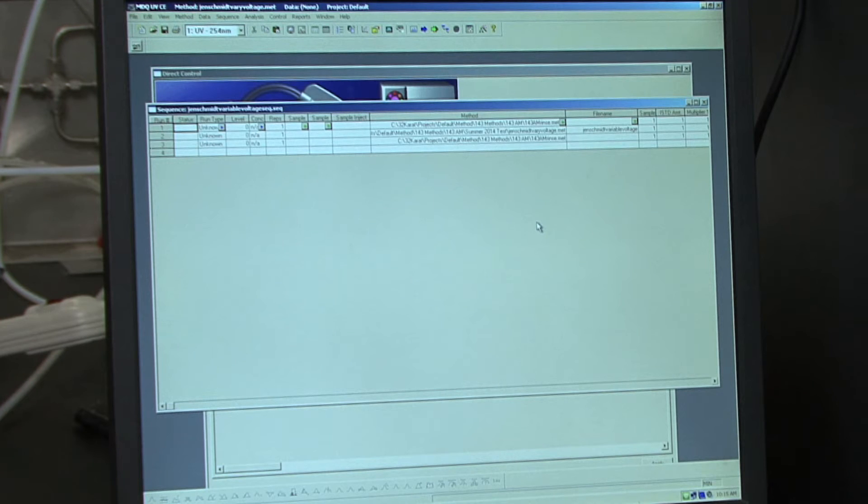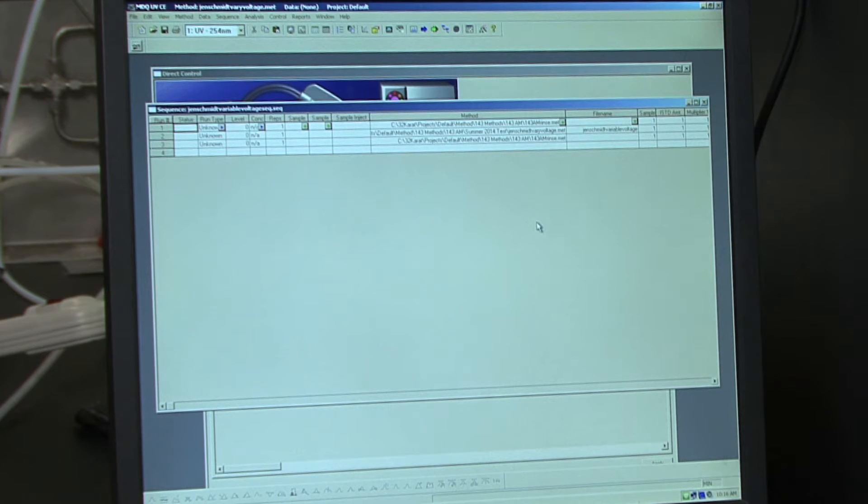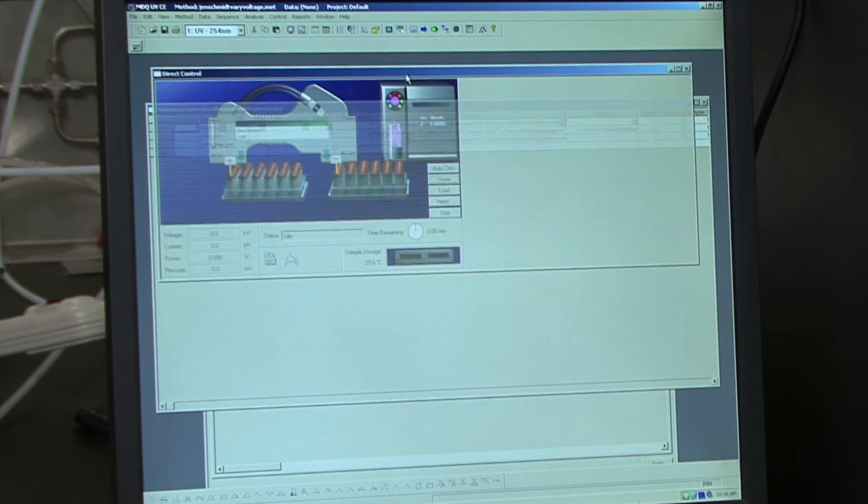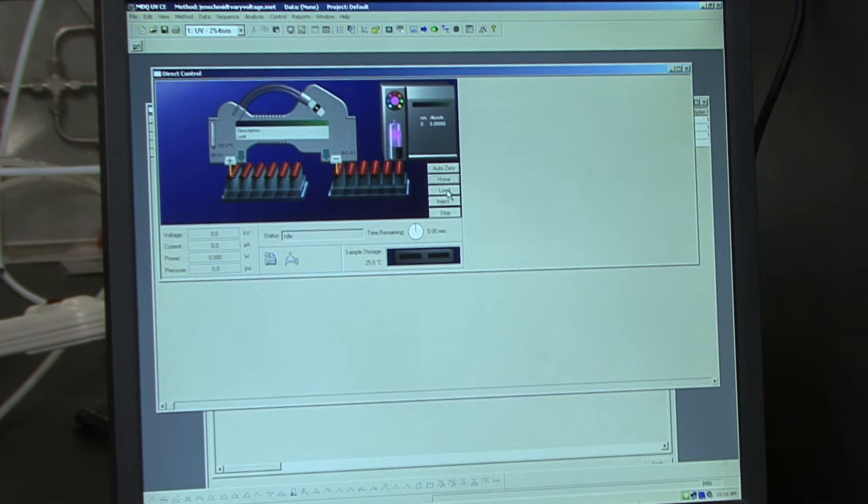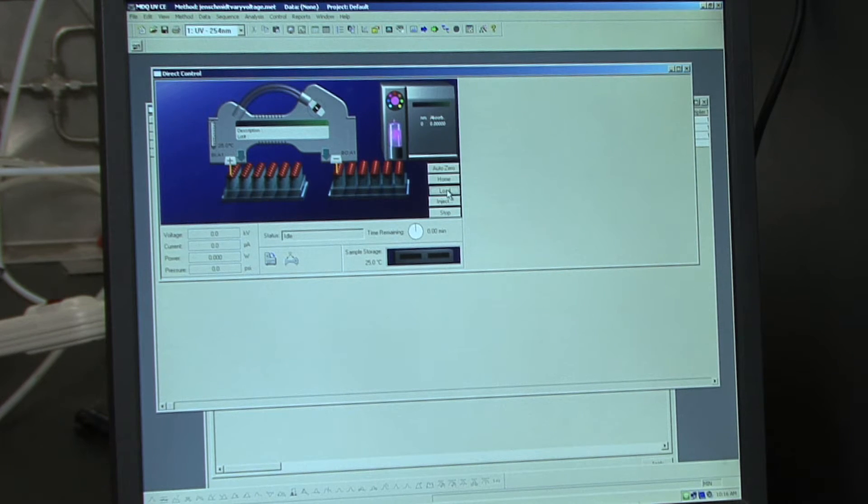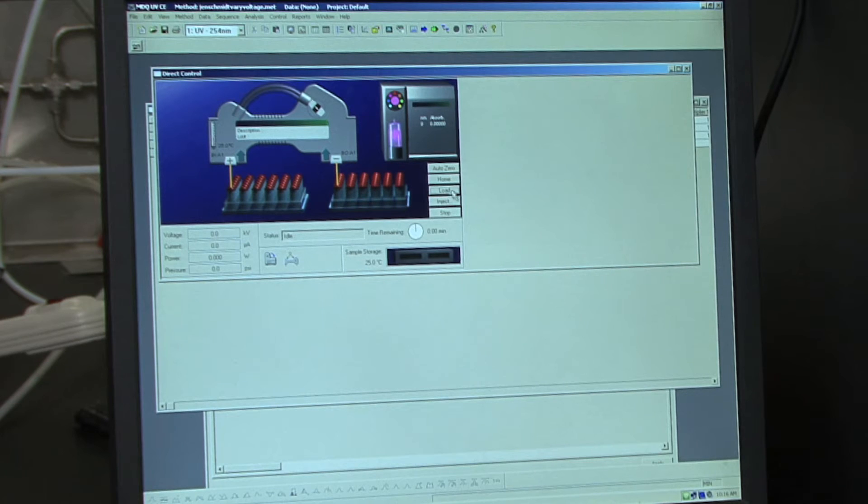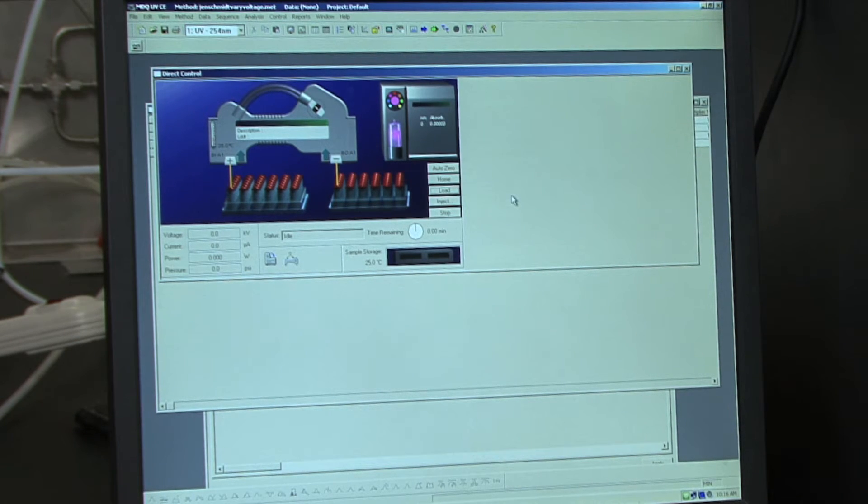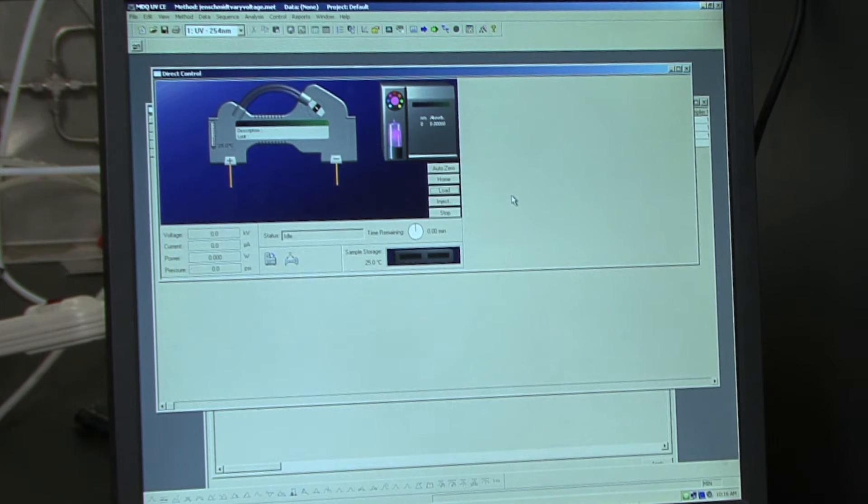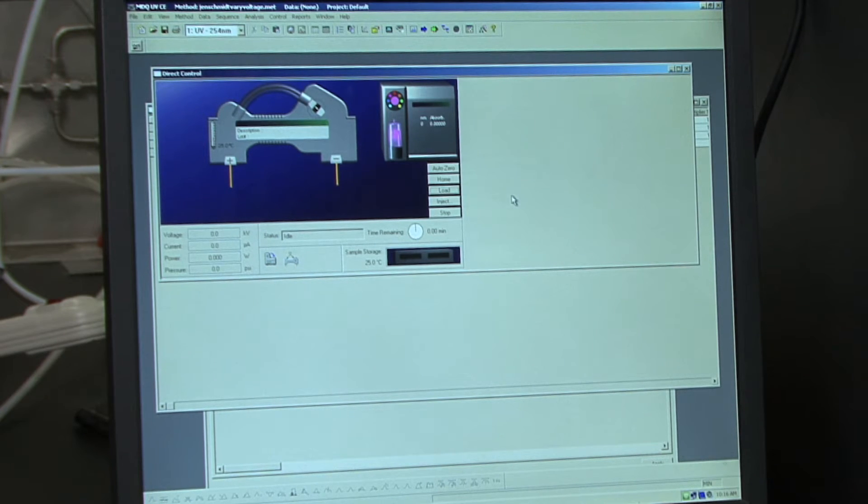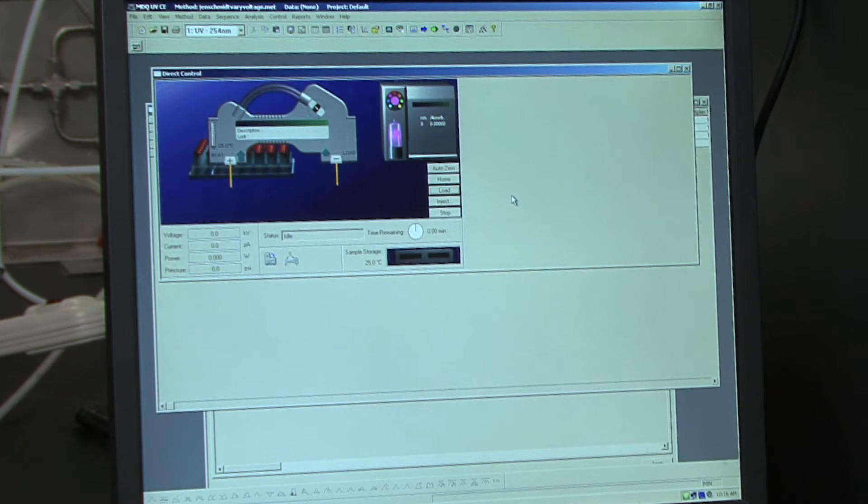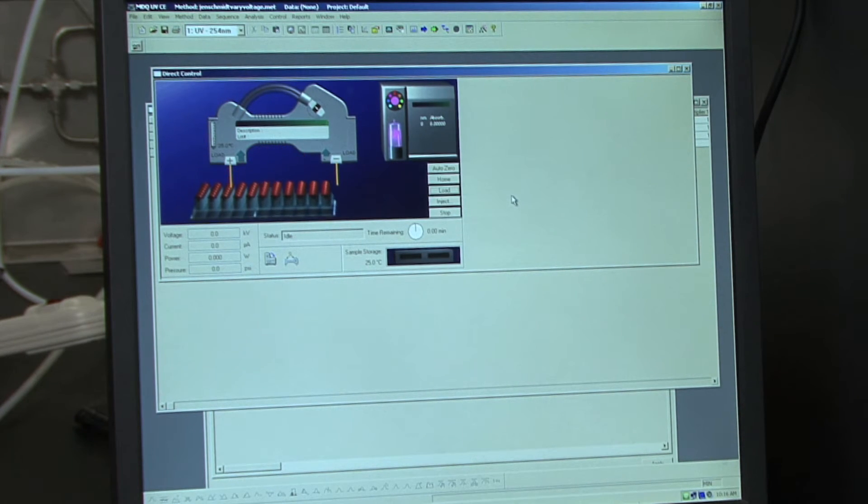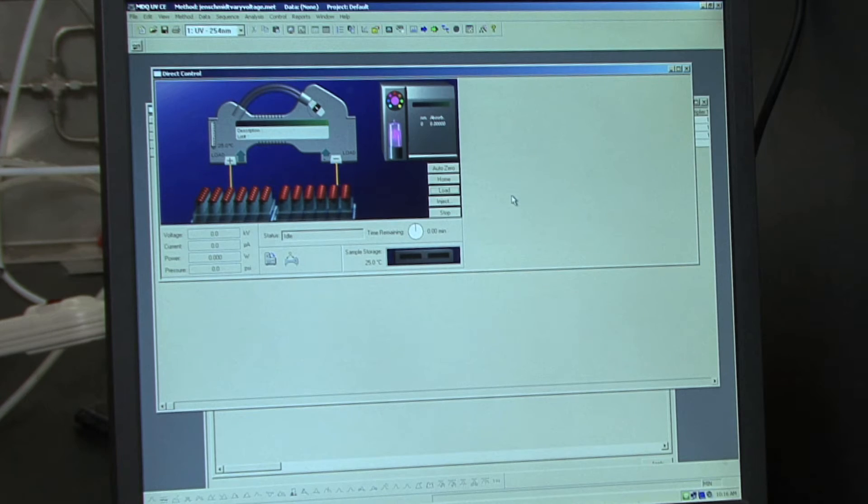So to load your sequence, you can click on load in the direct control screen. Once you do this, this will bring your tray to the front so you can load in your samples.